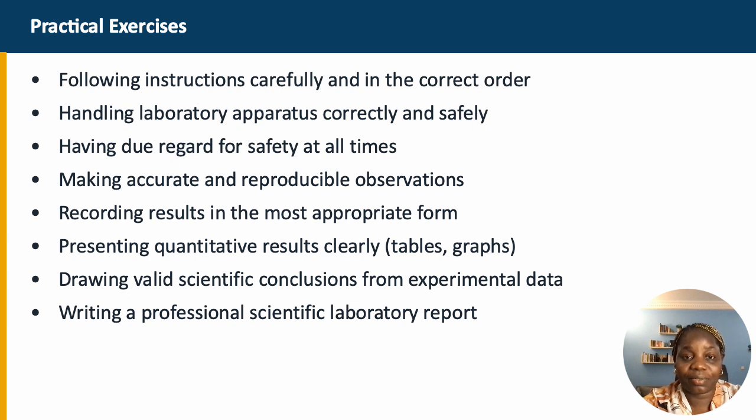If you follow the instructions carefully and in the correct order, if you handle the laboratory apparatus correctly and safely, if you take care of the equipment in the lab, having due regard for safety at all times, from the moment you enter the lab to the moment you go out, you need to keep on your PPE. Making accurate and reproducible observations, yes, discuss this in group. Record results in the most appropriate form.